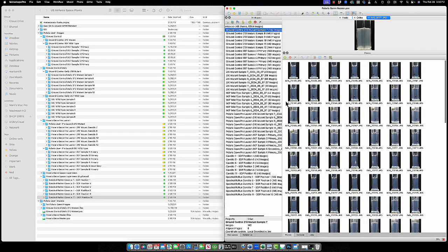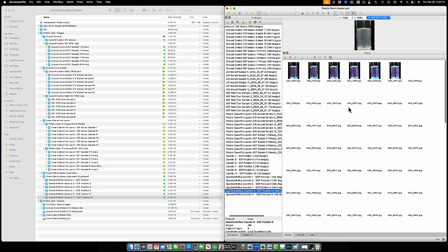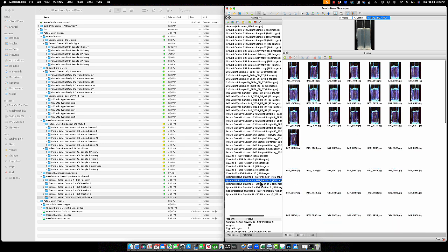All of our data is now uploaded into Agisoft Metashape. This includes the ground control, the samples that were sent to space, and the recently color-corrected 6 samples that returned from space after being frozen, just for high contrast. So, if I were to click on any one of these, you can then inspect the images and the photos corresponding to each of those samples.